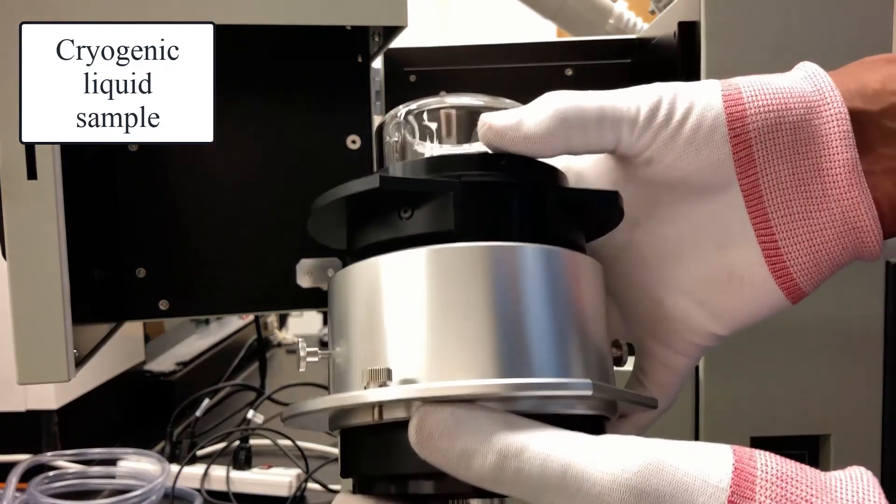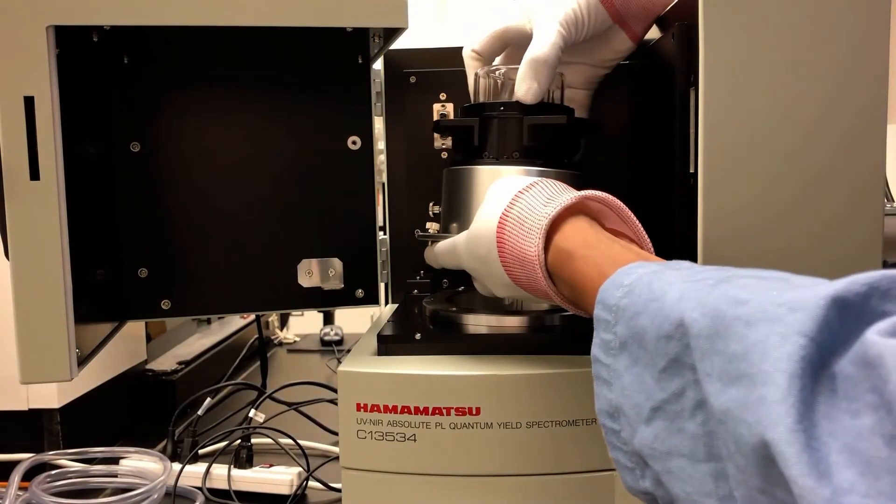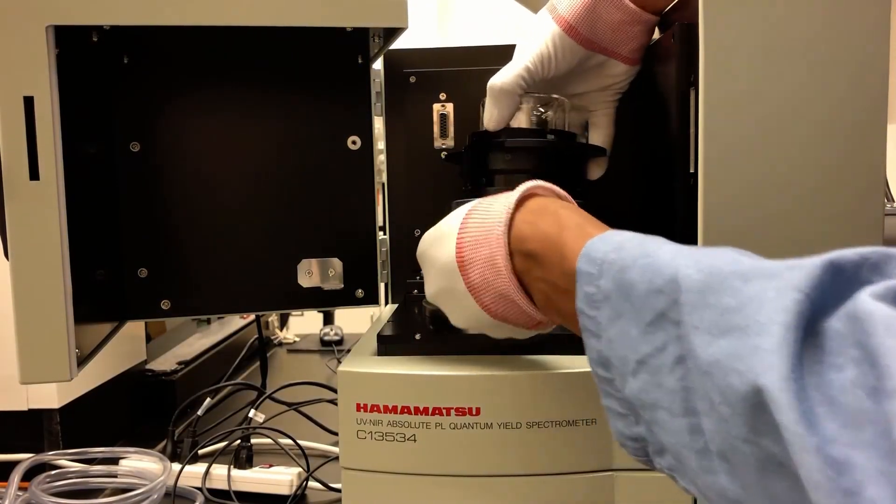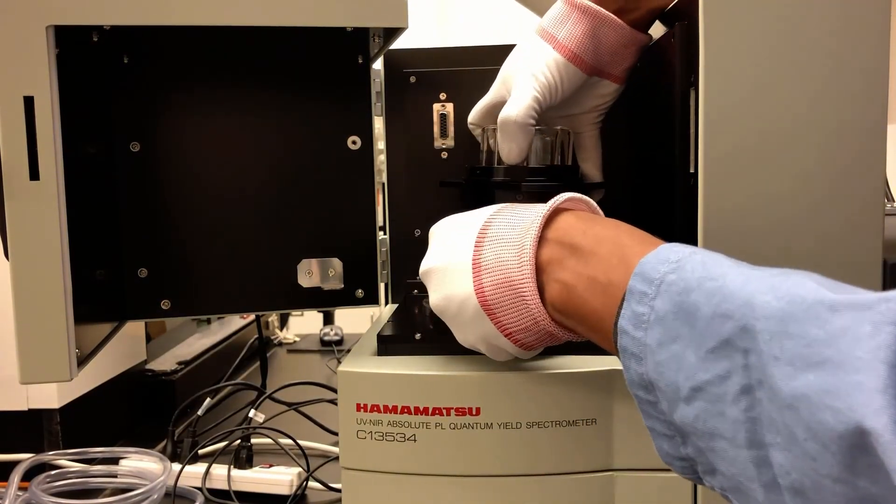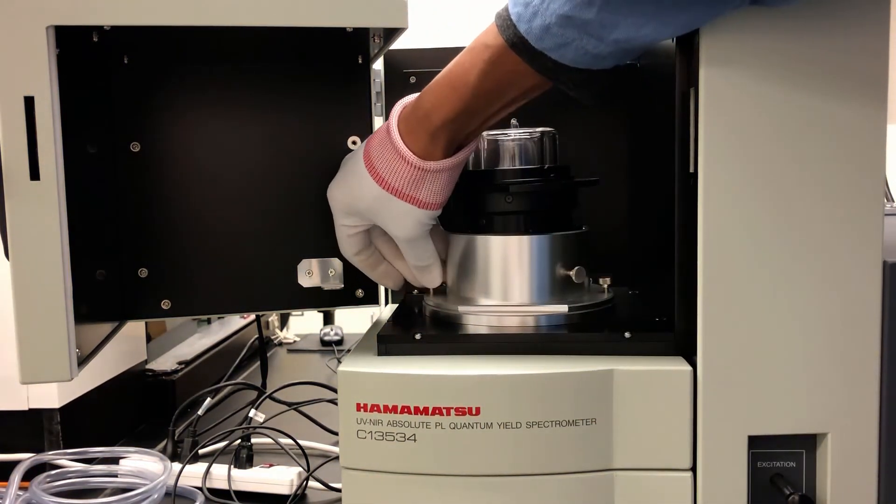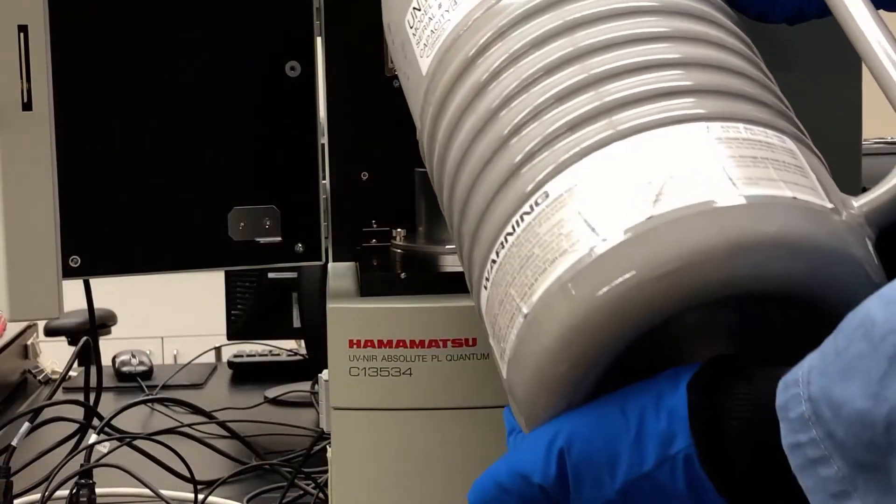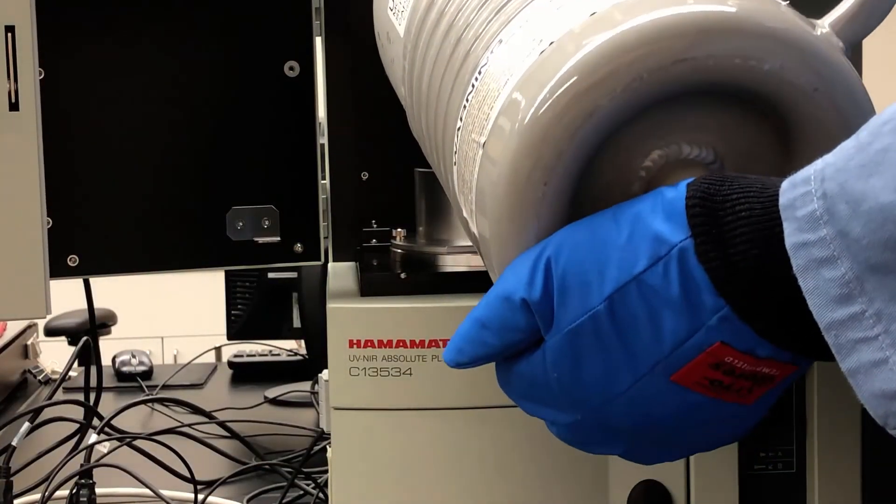Our final sample is a cryogenic liquid sample. You'll need this Dewar flask holder, which you'll find near the spectrometer. Let's set it up in chamber A and tighten the screws to hold it in place. If you're trained to use liquid nitrogen, you can fill up the Dewar.